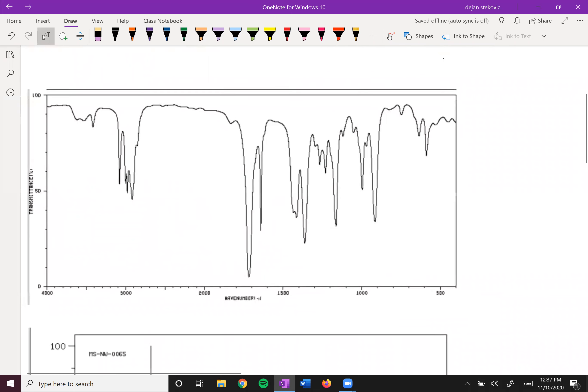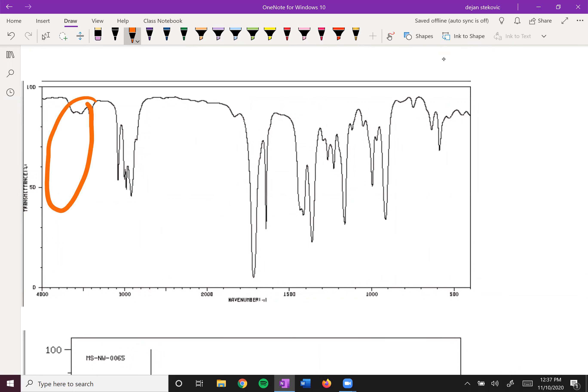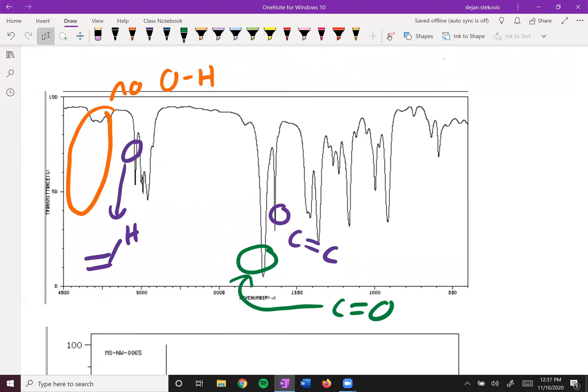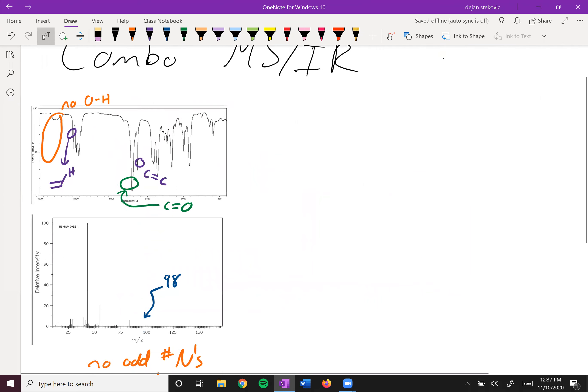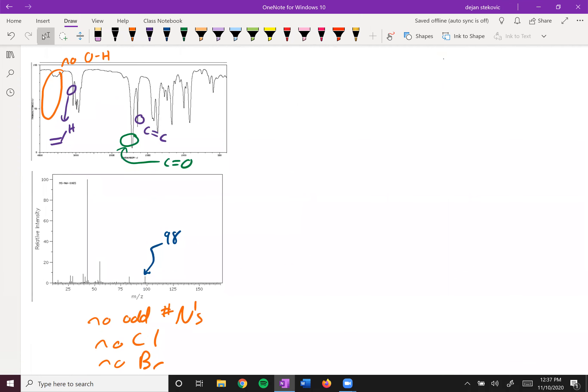Let's check out our IR spectra now. Over here we can tell there's no OH, so we know we don't have an alcohol in our compound. We do see this shoulder peak right here which represents a sp2 carbon-hydrogen bond, so we know we have something like this. Over here we also see the carbon-carbon double bond as well, so we know we have some kind of alkene. And then finally we see a very strong peak at 1700, so we know we have a carbonyl. You can tell we've already gained a lot of information about this compound just from studying it.